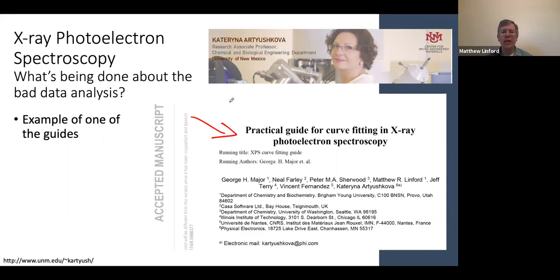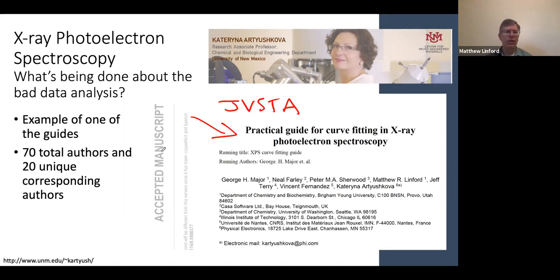in JVSTA. So this again is the Journal of Vacuum Science and Technology A. And this is just a great set of papers. If you're working with another technique, go find similar tutorial information. There's tutorial information being published all the time. And then again, I really think that maybe some formal training in the form of a short course or something like that from SVC might be a good idea if you're trying to learn more about one of these techniques.